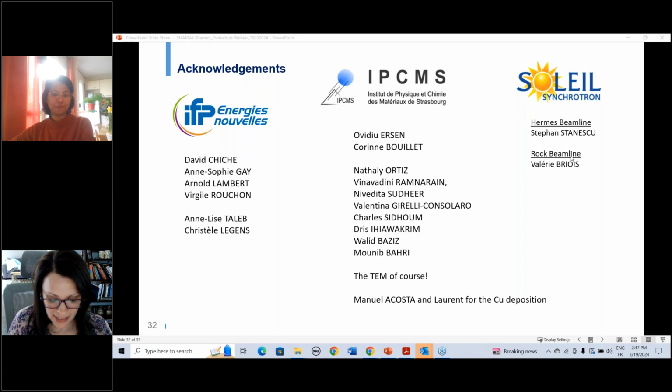What would be the ex situ tests that you would recommend performing before going into the TEM? I interpret this as, is there a set of ex situ tests to characterize a particular sample set that you would recommend so that you have a full understanding of your sample before you go into the TEM and do in situ? Yes, yes.